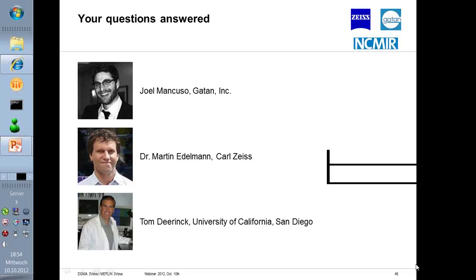The next question, I think, is for Joel again. Do we need to change the diamond knife from time to time?